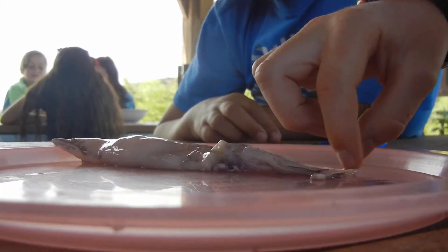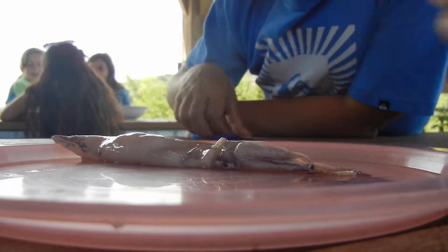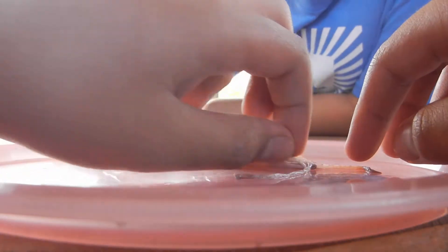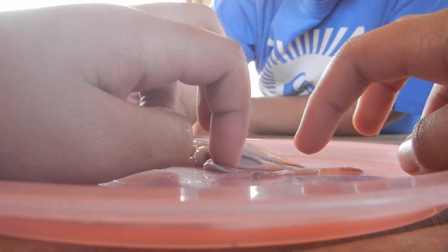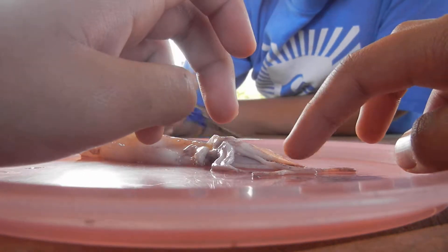YouTube's 3, 4, 5, 6 tentacles? Wait, 1, 2, 3, 4, 5, 6, 7, 8. 9 where? No, this is the 8, or the 7.